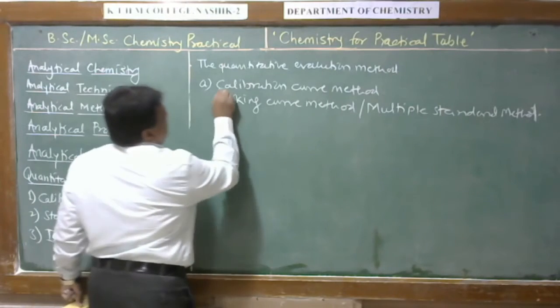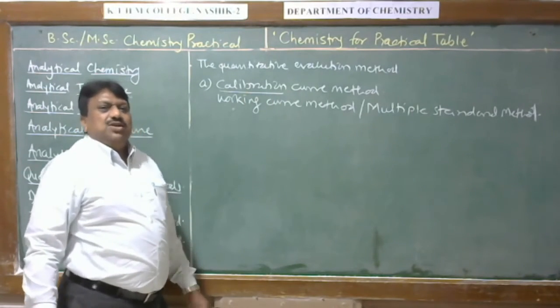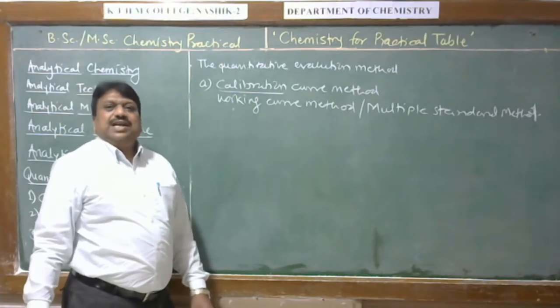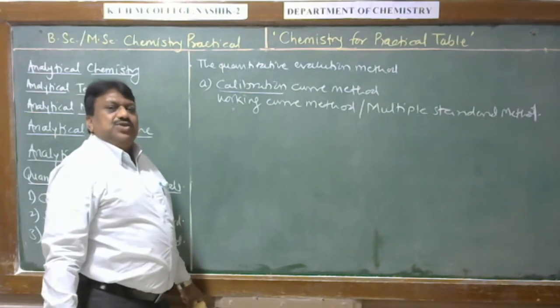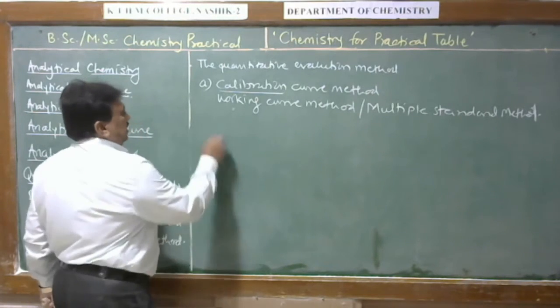Here calibration is a term related to establishing the relationship between the instrumental response and the concentration of analyte.